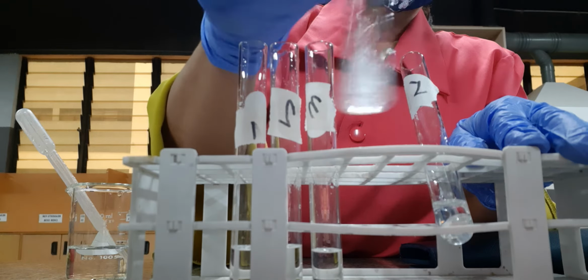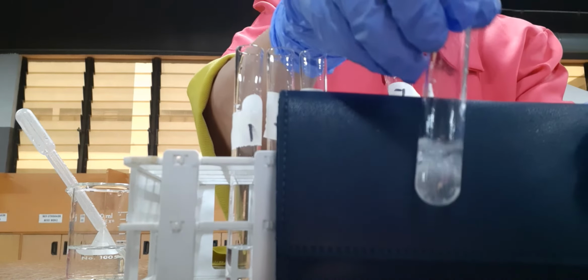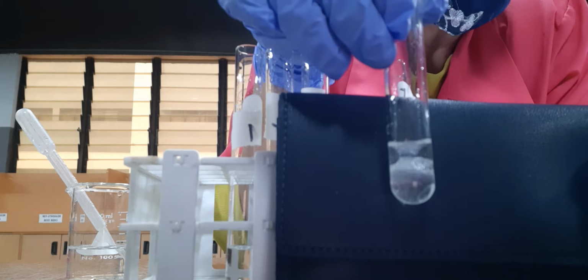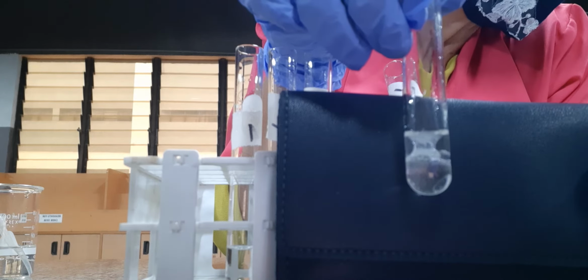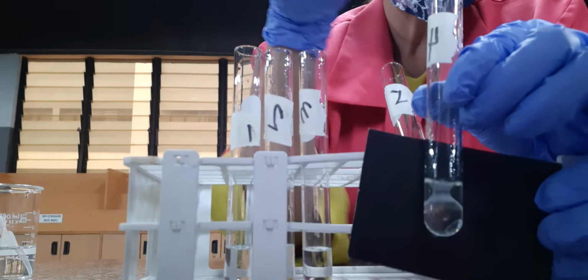Try to look at what results with benzaldehyde and water. What do you think? It forms a layer, no? This is benzaldehyde and water. So it forms a layer.